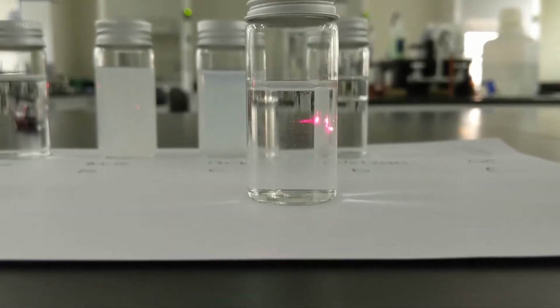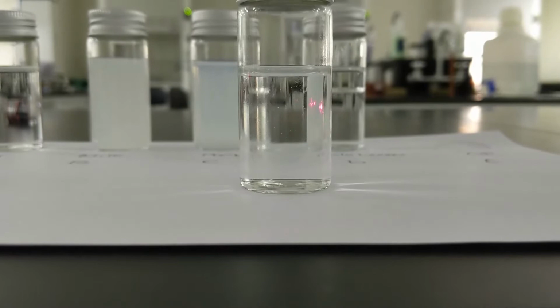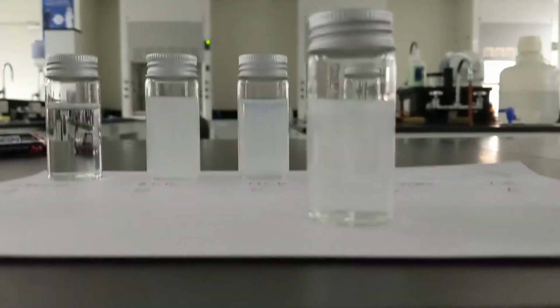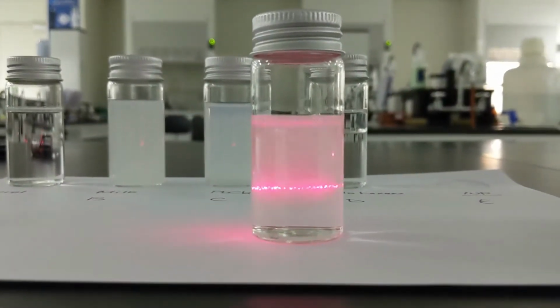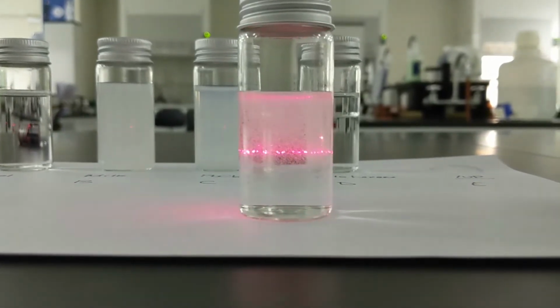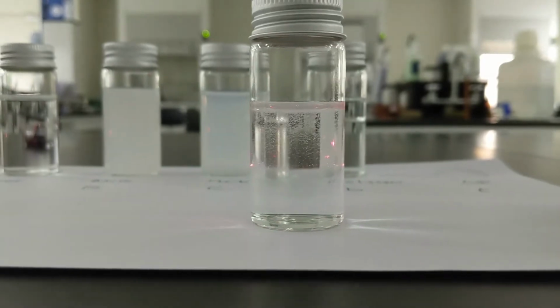And this is something we talked about in the course. There's a way to break colloids or break suspensions. And I'm doing that by shaking this up. I'm allowing the molecules to do something. But it's really interesting because almost instantly the effect begins to fade. Pretty cool. All right, now I'll be right back.